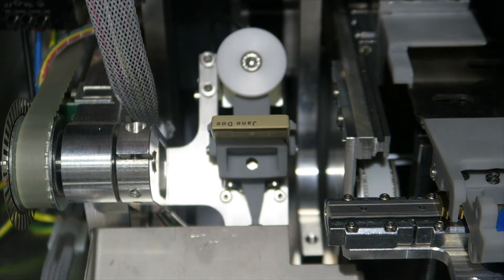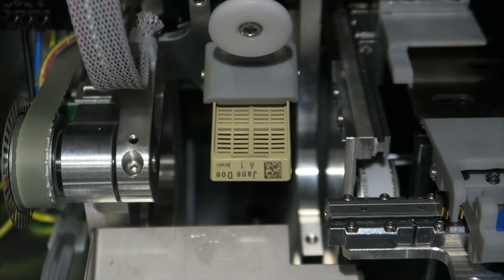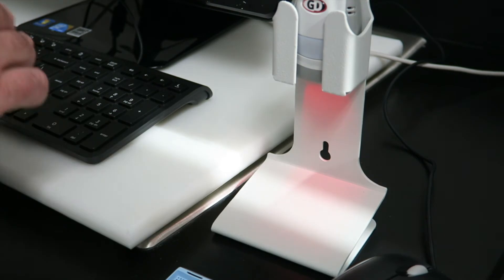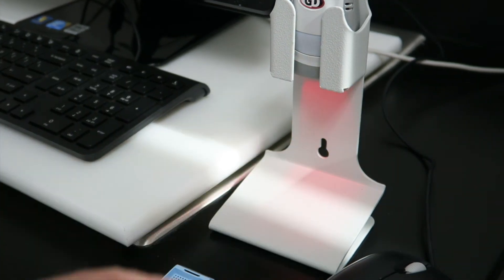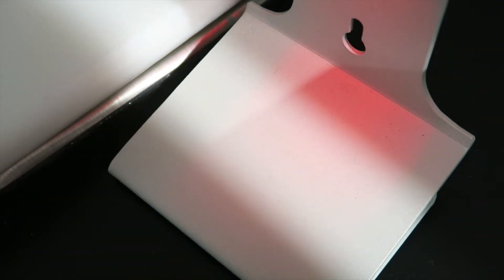The simple internal feeding mechanism greatly reduces the possibility of cassettes jamming in the printer. The cassette is the only consumable - no inks, ribbons, print heads, filters, or extra consumables are necessary.